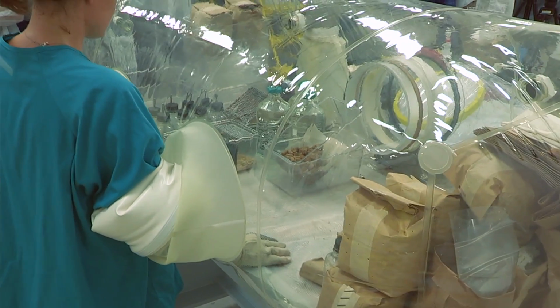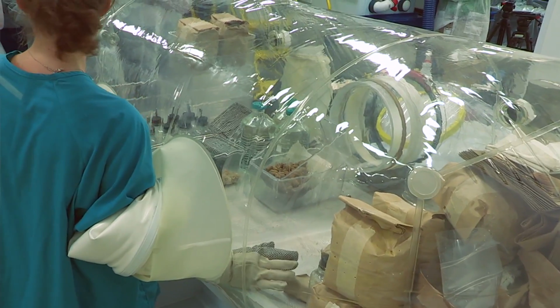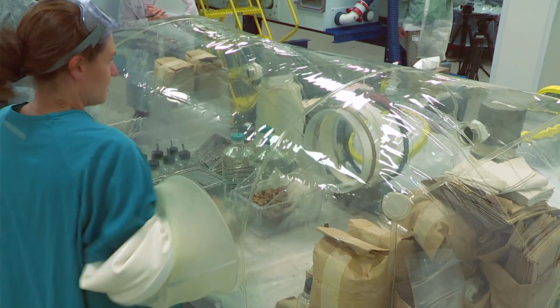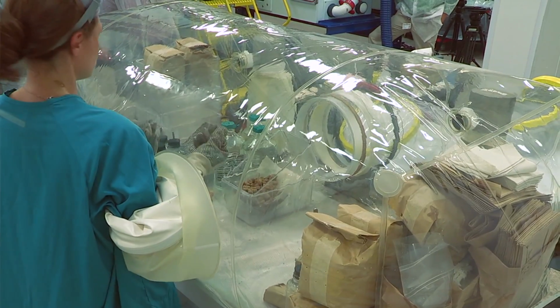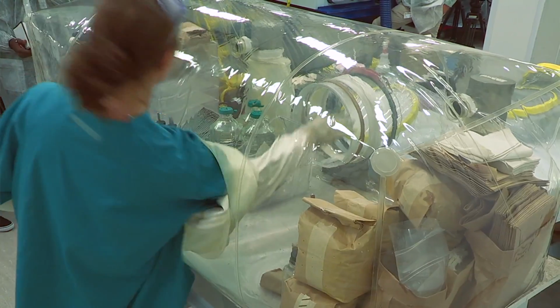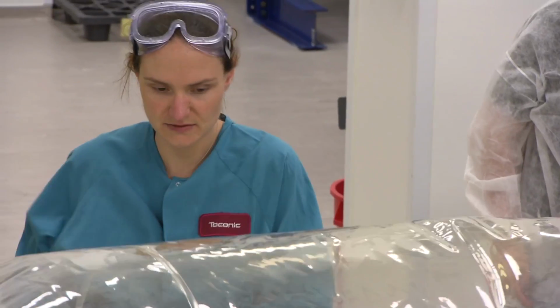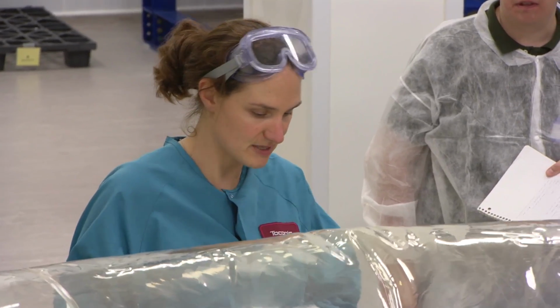Then the last thing is just our weekly isolator check. You want to make sure that the isolator doesn't have any holes. So again, we're always looking at the fingers, in between all of the fingers, up the sleeves, inside cap. When the cap is off, you want to check your port. Make sure you don't feel any rough burrs on the port, because that can be a source of holes in your cap. It might be just a little piece of the plastic that chipped off. The main source of holes are seam splits. That's usually what ends up happening.